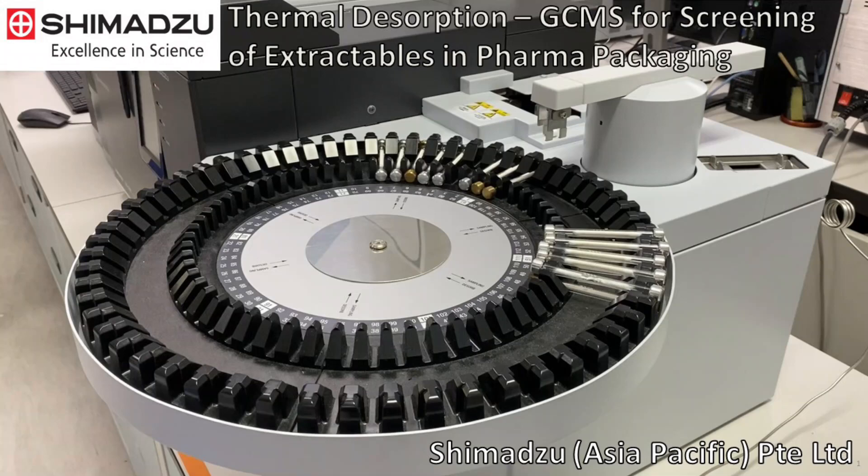In this video, Thermal Desorption GC-MS will be described as a tool for the screening of extractables in pharmaceutical packaging.